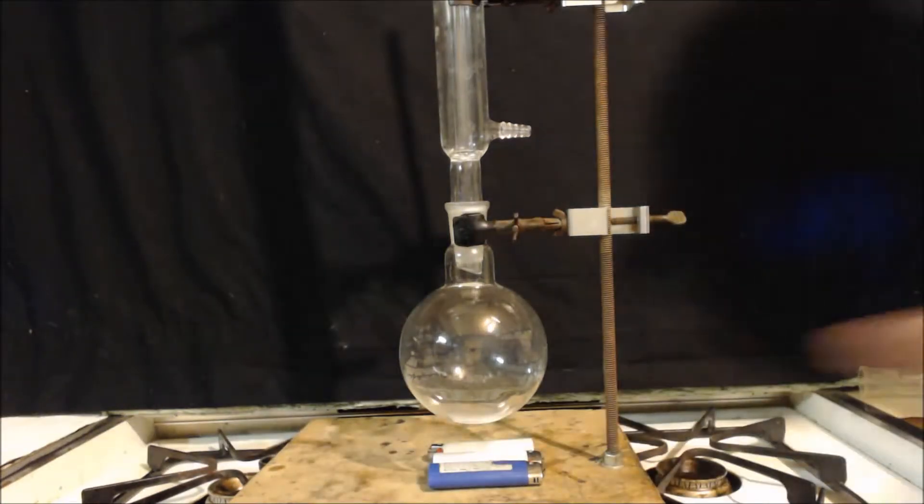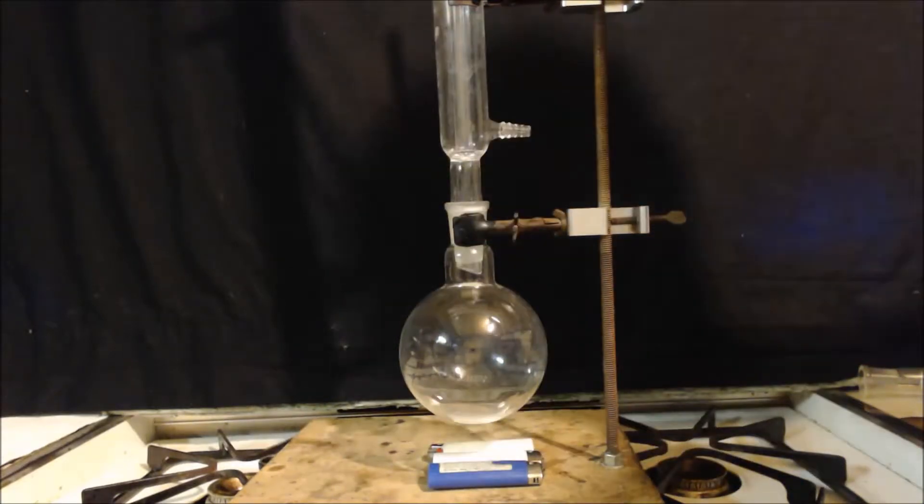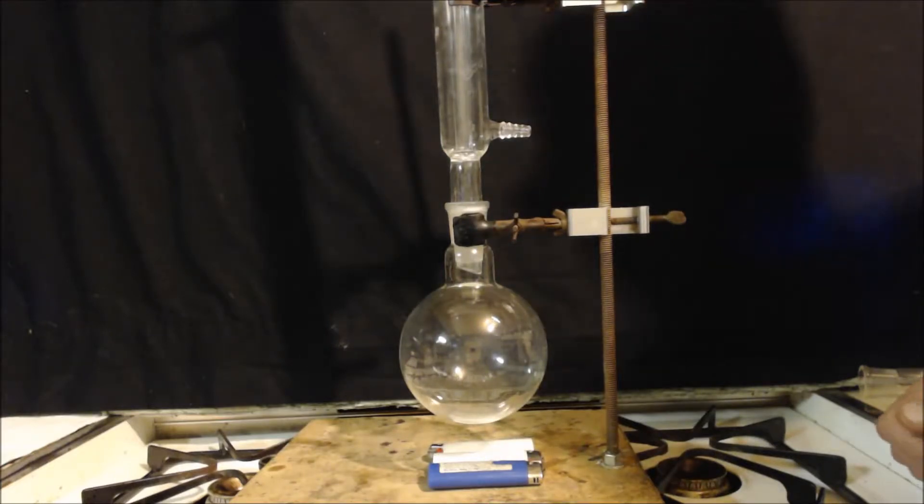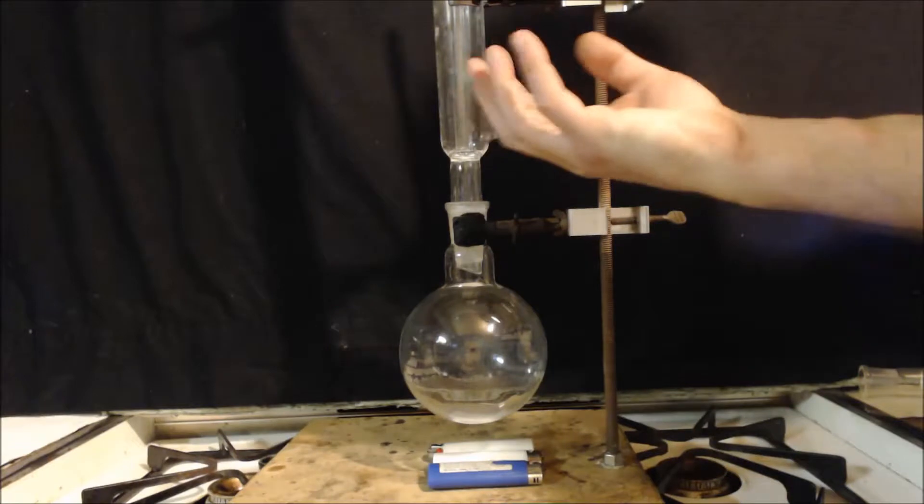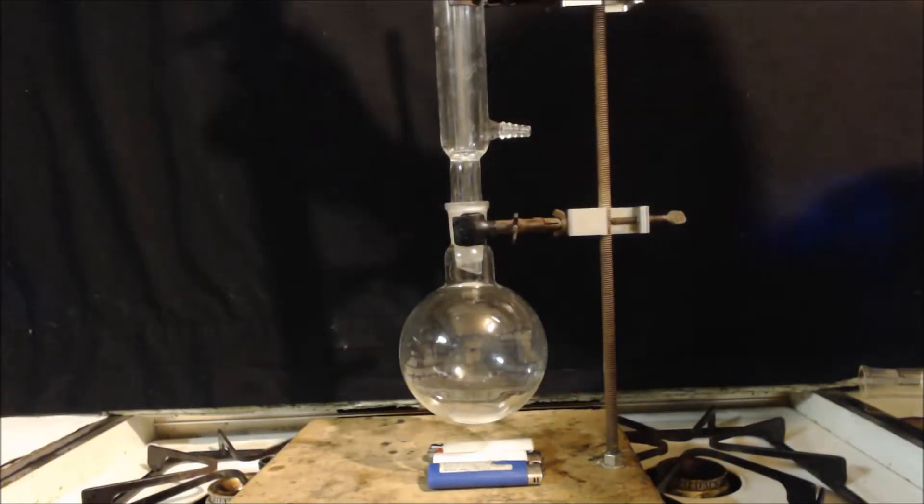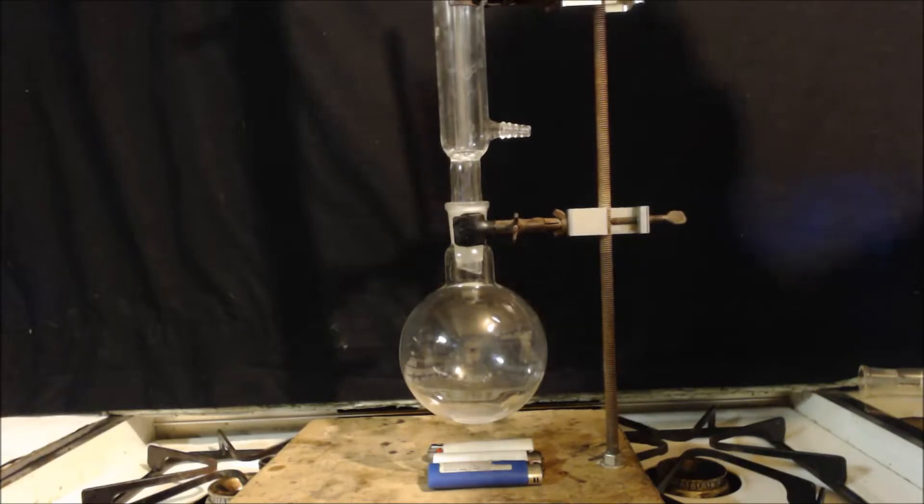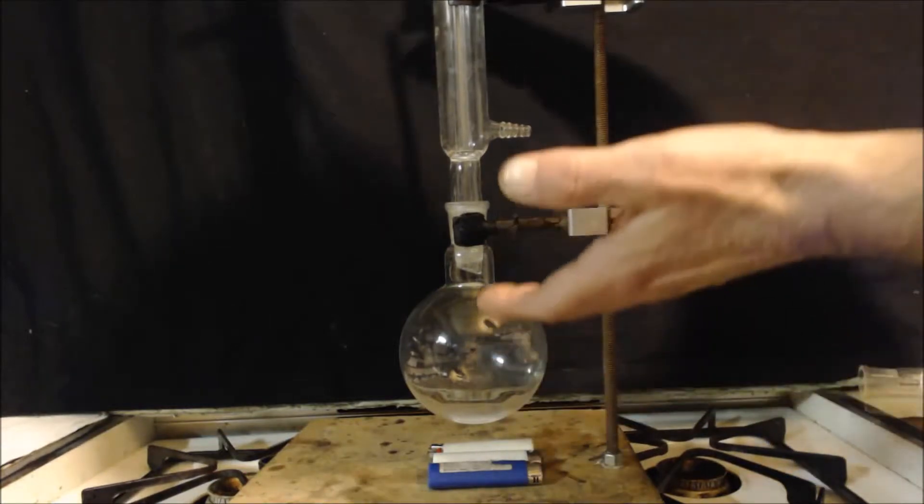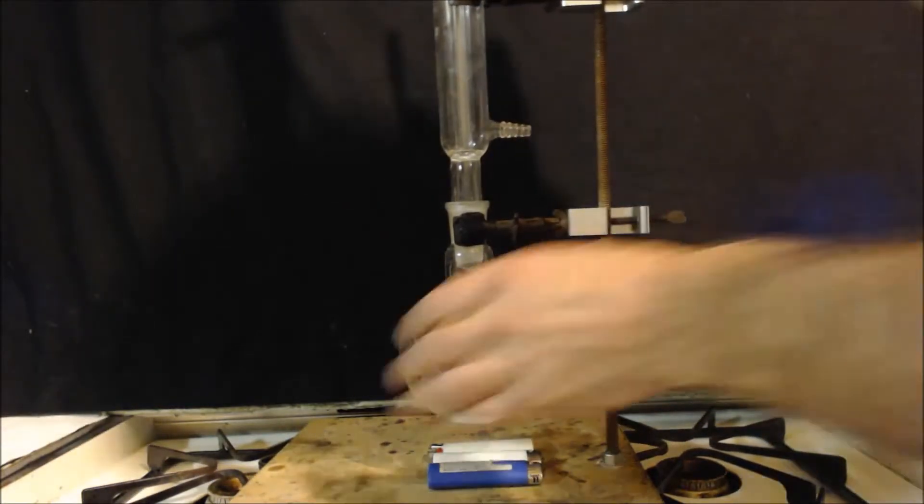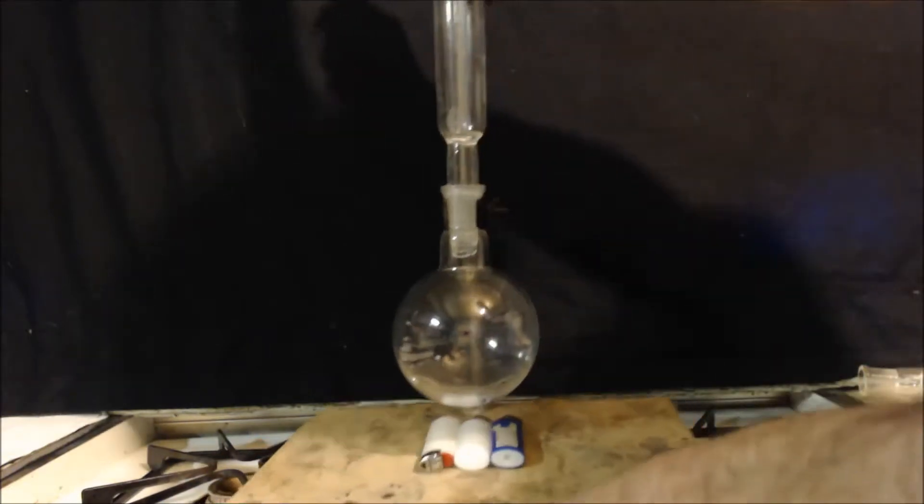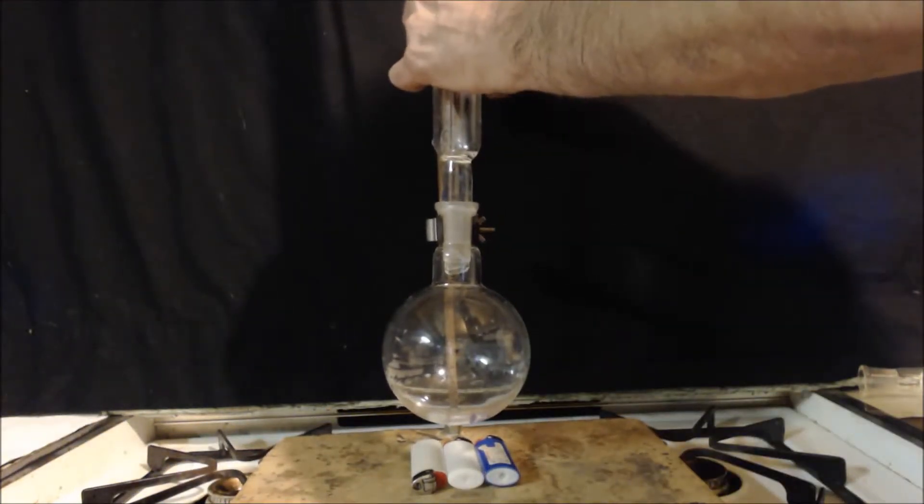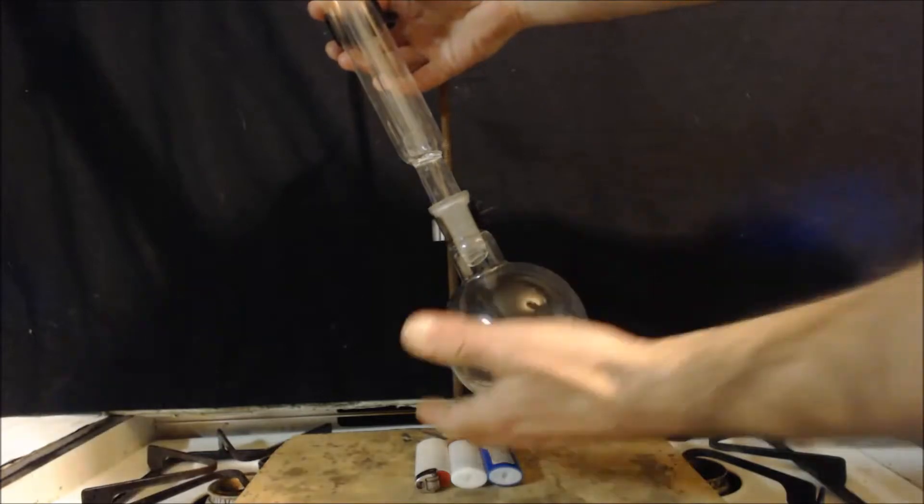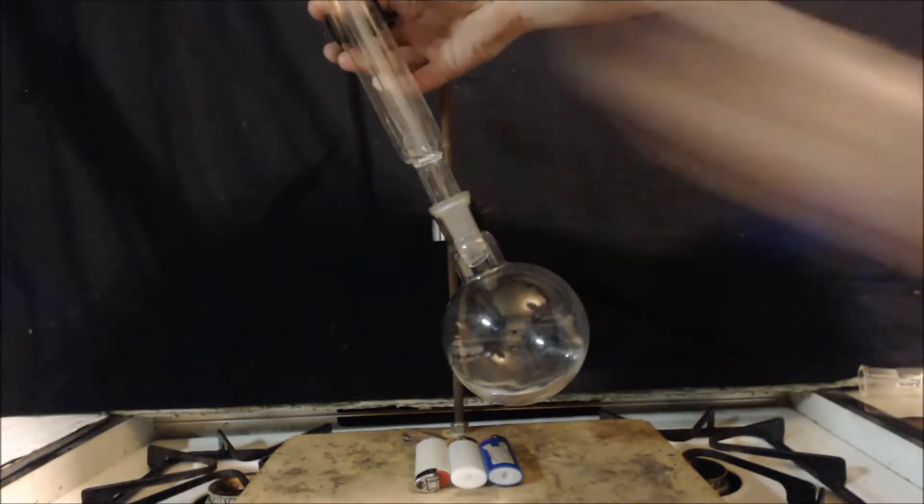And one thing I learned about this is if you have your heat source here and you're using ice or whatever to cool this condenser down, you will go through so much ice, it will be unreal. Because your heat is just coming straight up, straight directly onto what you're trying to cool. So what I normally do is I put an adapter on here. And you can always, if you don't have an adapter, you can always just tilt this a little bit. Just tilt it like that and that way your heat comes up and it doesn't get all of this.